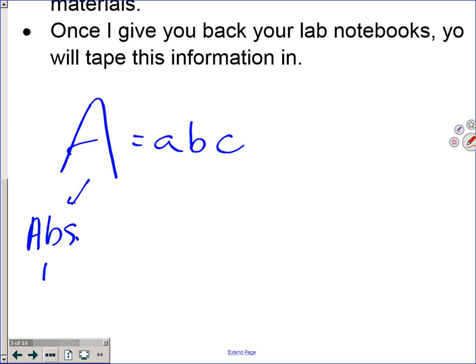Absorbance, and that's what we'll measure in the lab. That's what our Spec 20s and our colorimeters, which I have some colorimeters which might be interesting to use for today. That's what I will be measuring in the lab.